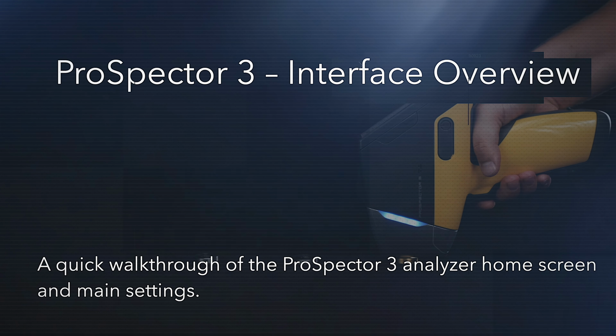So the next we have the screenshot button. It's very easy. You can just make the screenshots. You see on the bottom of the screen the print screen item, and if you press the print screen button, the analyzer will take a screenshot of the whole screen.